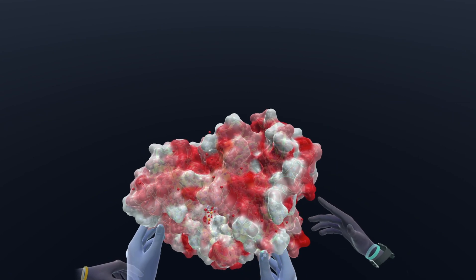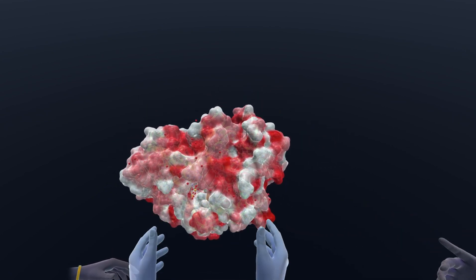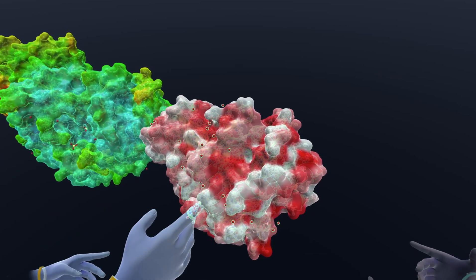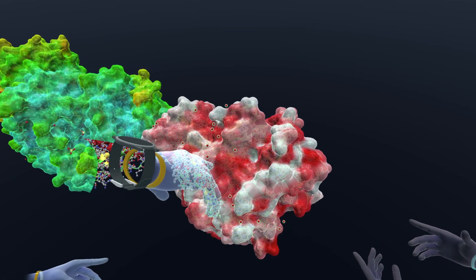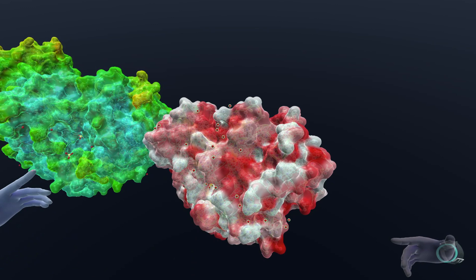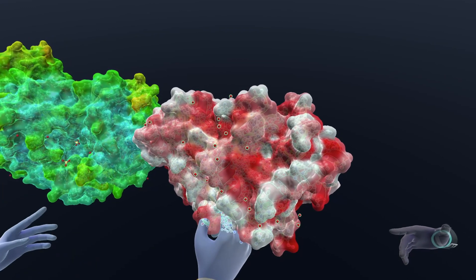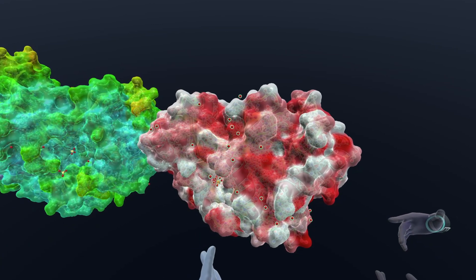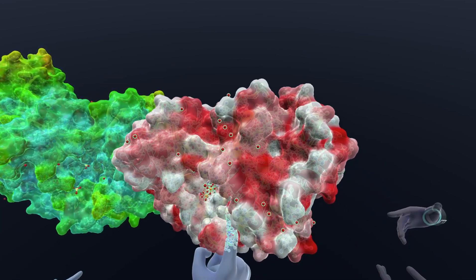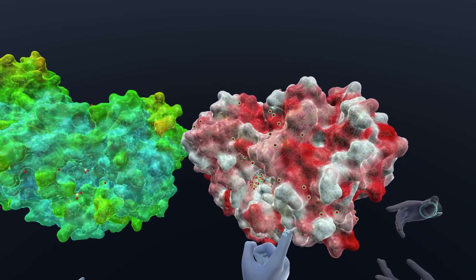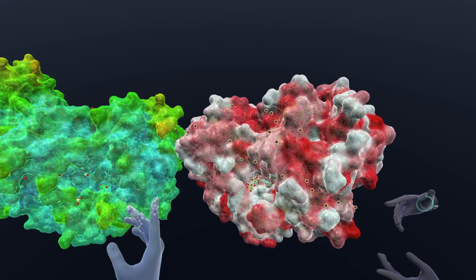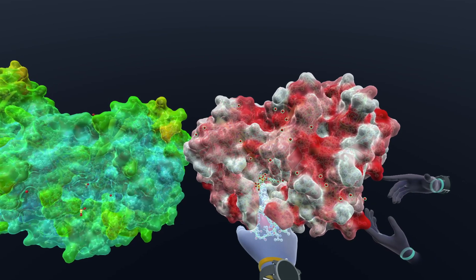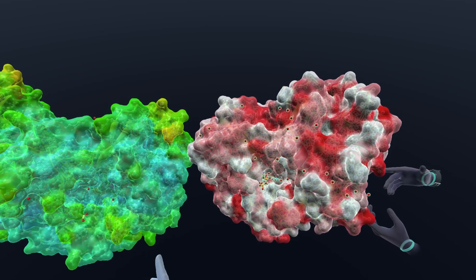Rob, did you want to show us how this aligns with the whole structure? Sure thing. As we can see here, 4WTG and 4GMC - 4WTG is this chain, 4GMC is the 4GMC protein. We can look and see how we have the same binding pocket right here. That's how we know where it fits in. We see our phosphate groups in here, there's some sulfates hanging out in this one.